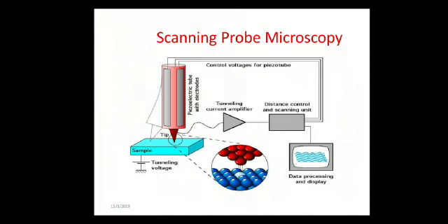However, the images are often colorized, with different colors representing the different properties, for example, height along the surface. Usually the scientist uses scanning probe microscopes in a number of different ways, depending on the information they are trying to gather from a sample.